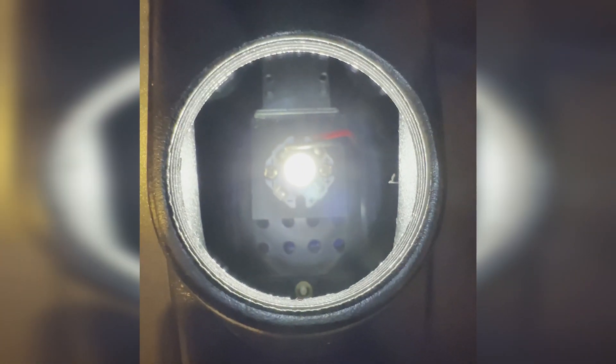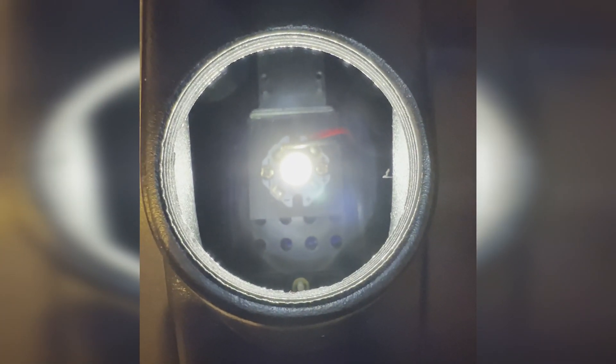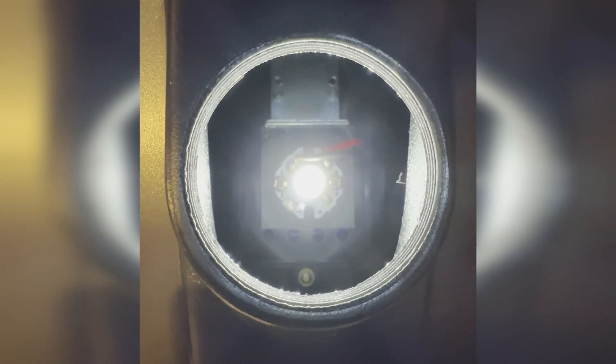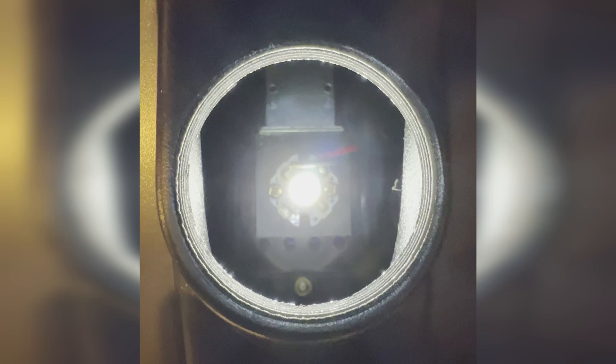Those two screws control the position of the LED below the field lens. When you move them all the way forward, the LED should be pretty close to perfectly centered, giving you maximum brightness.